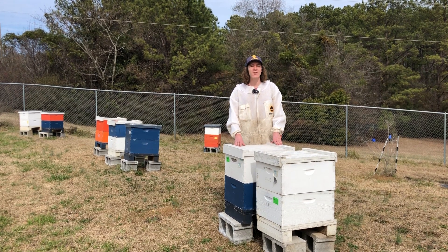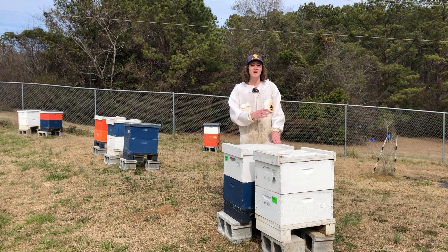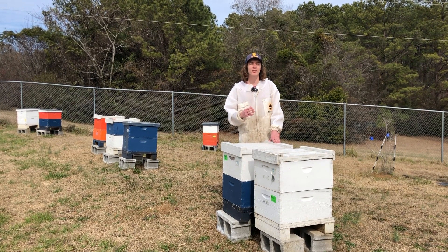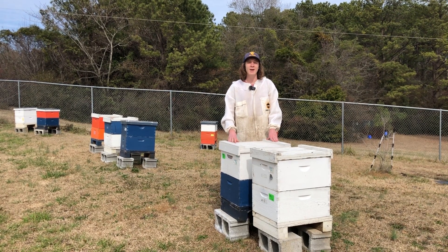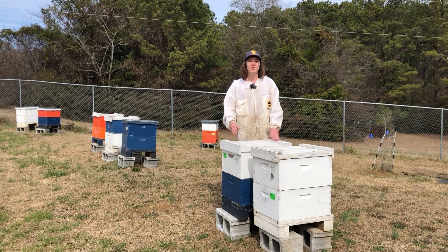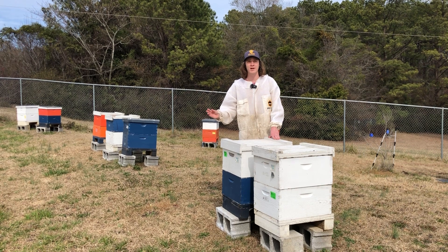Amitraz is extremely effective at killing Varroa mites, and it's been very effective for the last 20 years. However, continued reliance on Amitraz in some beekeeping operations as the sole form of treatment for Varroa has started to lead to some Amitraz resistance issues. So I'm going to be teaching you how to do an Amitraz resistance test to see what kind of Amitraz resistance levels you have within your operation.